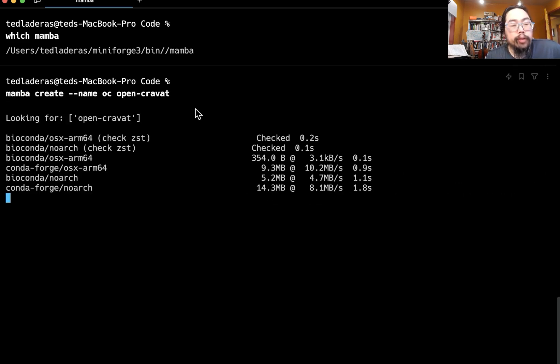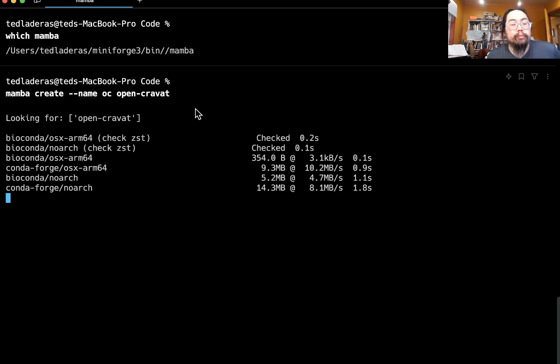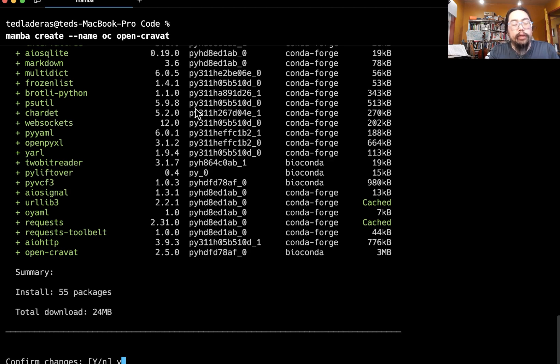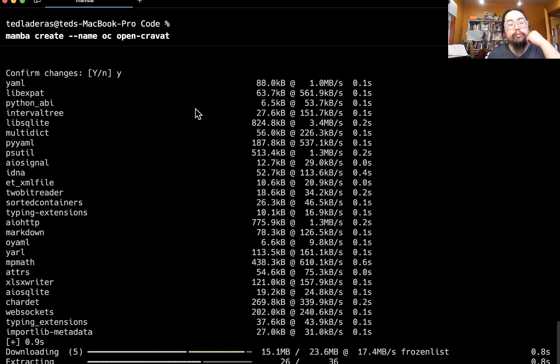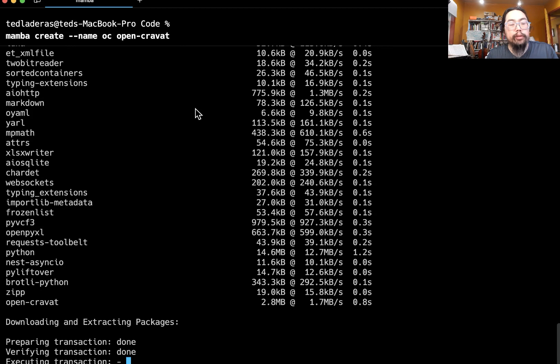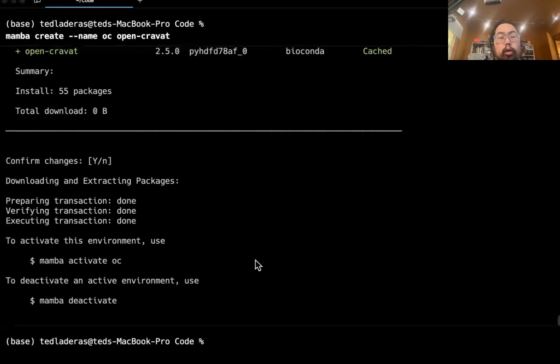So here you can see everything is getting installed. And then we want to confirm changes. We'll come back when this is finished.